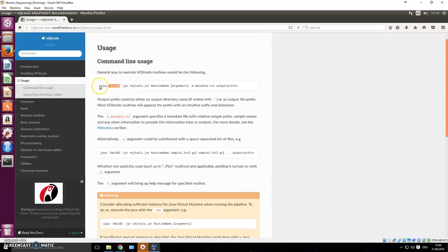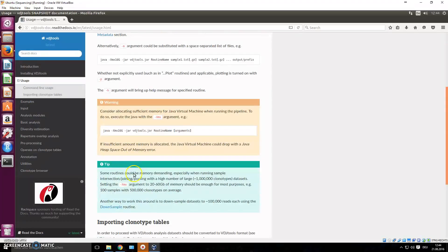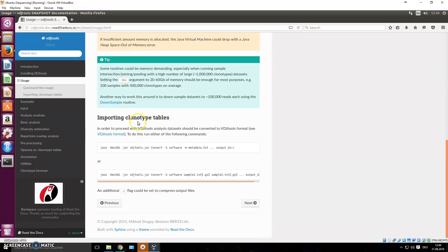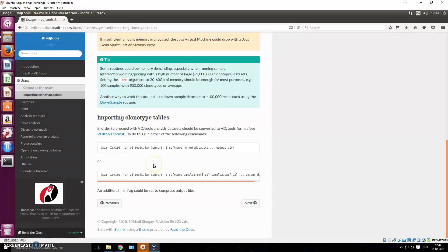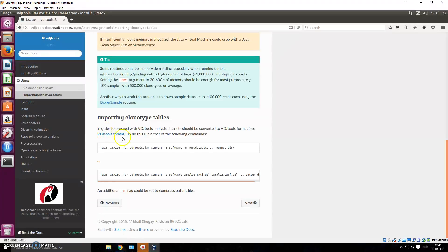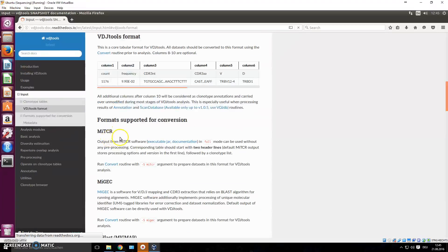We go back to the documentation and 'Usage' to start using it. The memory flag just sets how much memory is used. The first thing you should do is import clonal type tables — you have your aligned data from different sources. We could have it from MiXCR, IMGT, or other tools to align your immune cell sequencing data. We used MiXCR in our last example and now want to import that into the VDJ tools format. You use 'convert -s' followed by the software name.